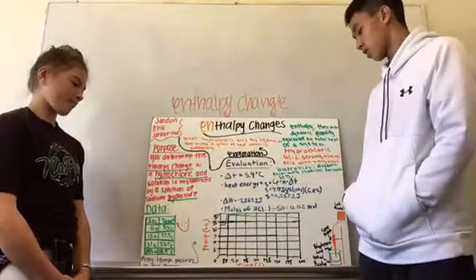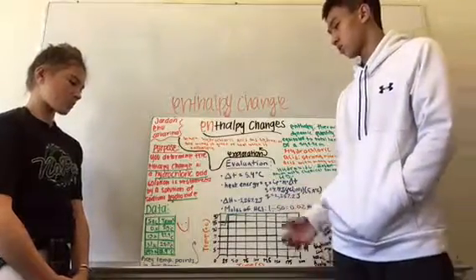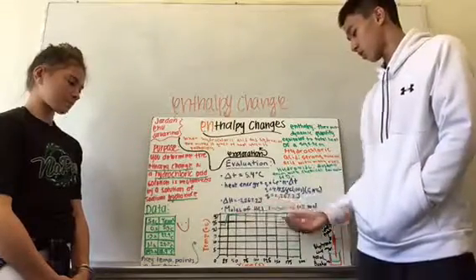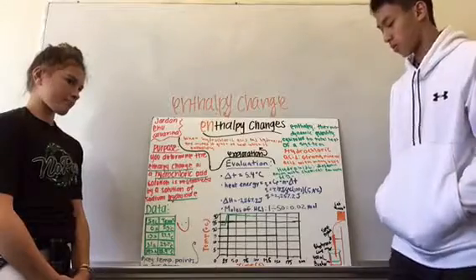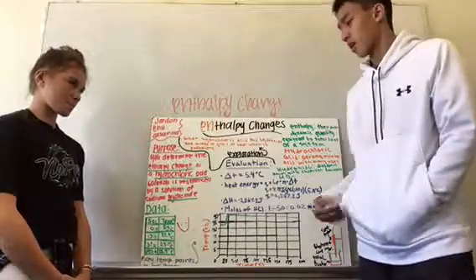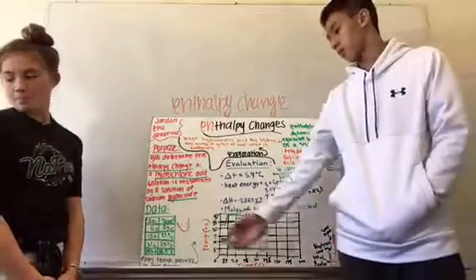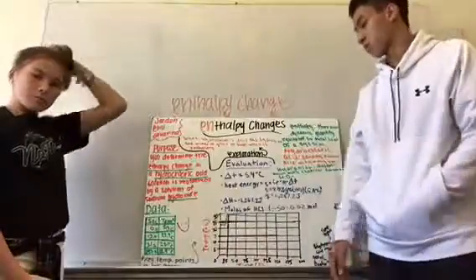And then over the next 180 seconds we just measured how the two mixed together and what their temperatures were, and we noticed that their temperature eventually decreased, but not by that much, only by about 3 degrees Celsius. And here on the table we have key points in this graph: the beginning temperature, where the temperature spikes, and then the end temperature.